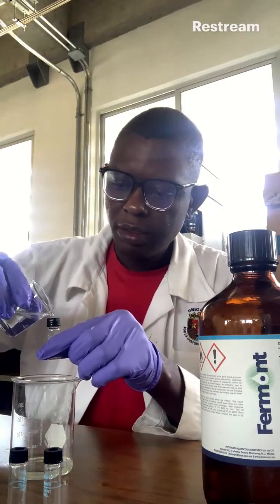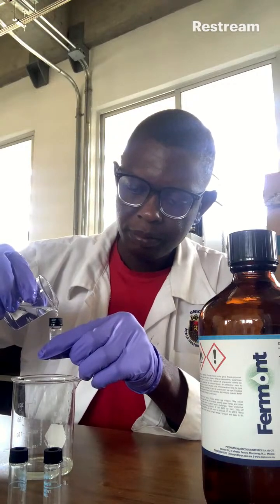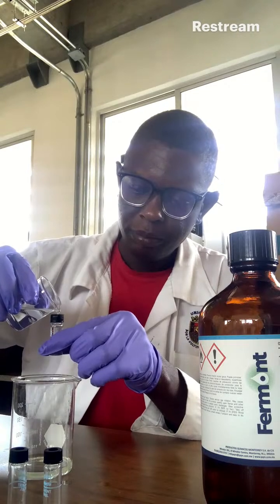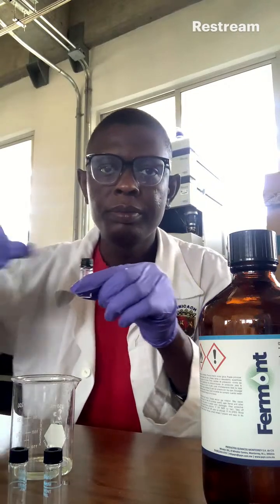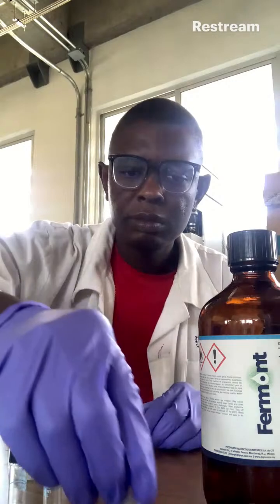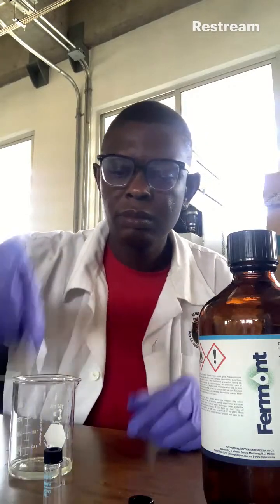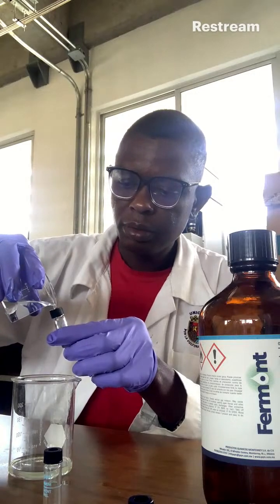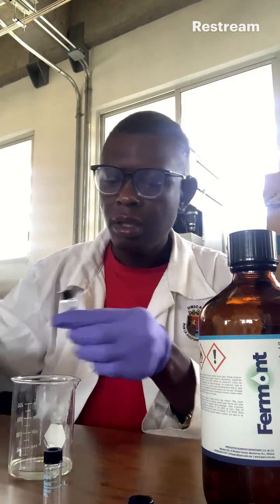And I fill it. The same thing happens to the second one. I wash it.